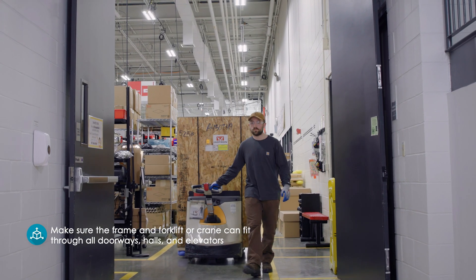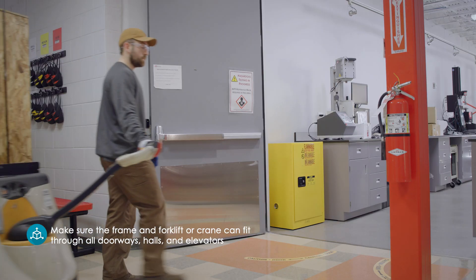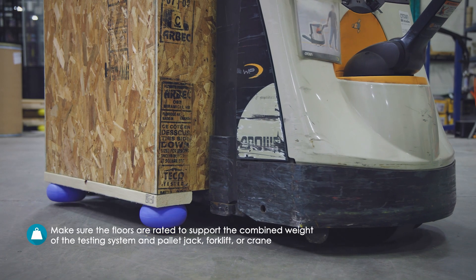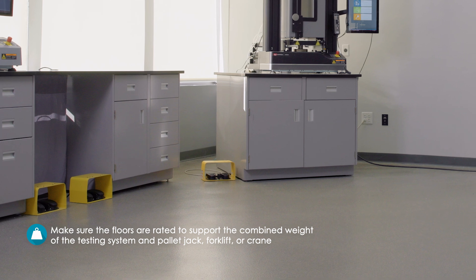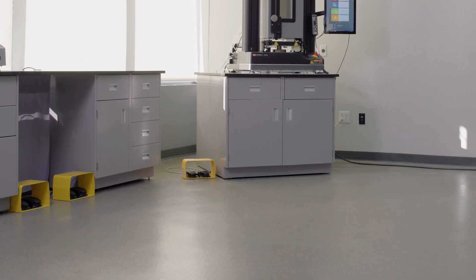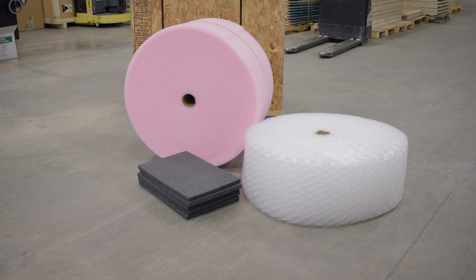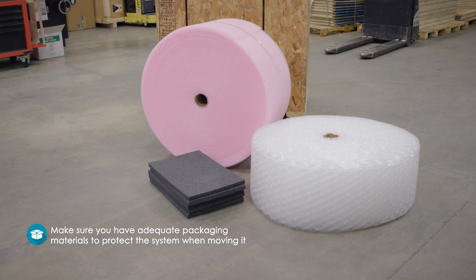Check to make sure the frame and forklift or crane can fit through all doorways, halls, and elevators between the receiving location and the final site location. Check to make sure the floors from the shipping dock to the final site location are rated to support the combined weight of the testing system and pallet jack, forklift, or crane. Ensure that the lifting equipment has a load rating that is double the load frame's gross weight.